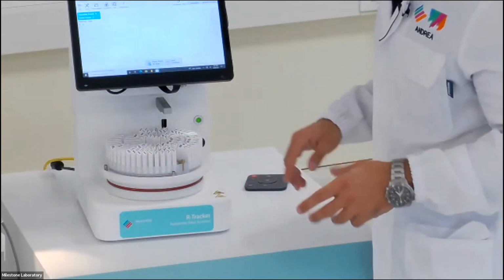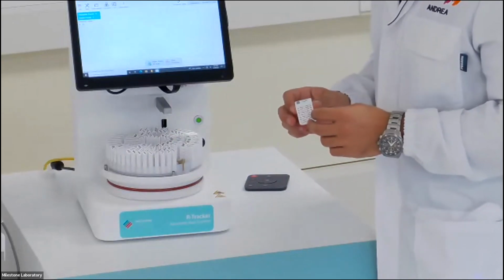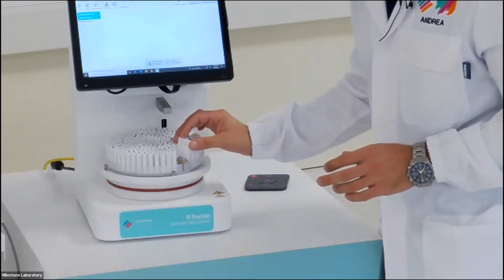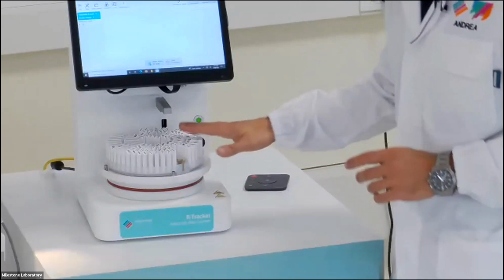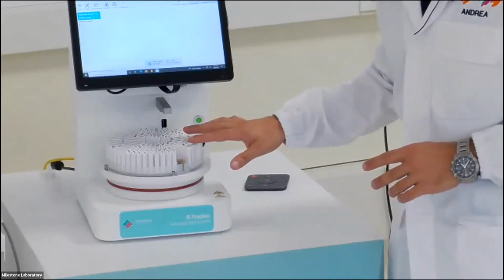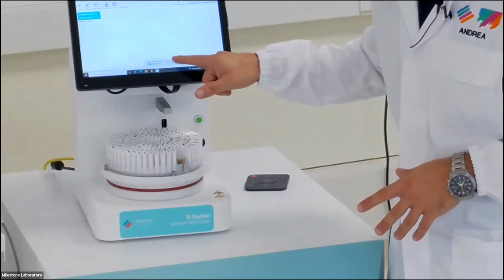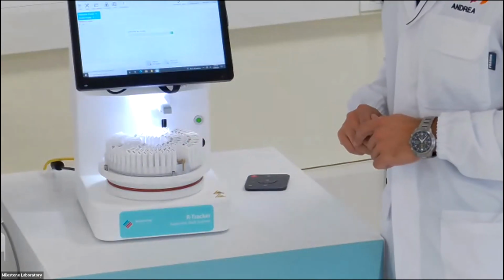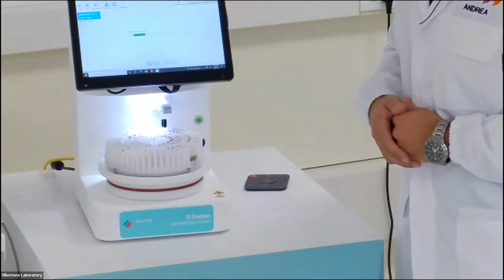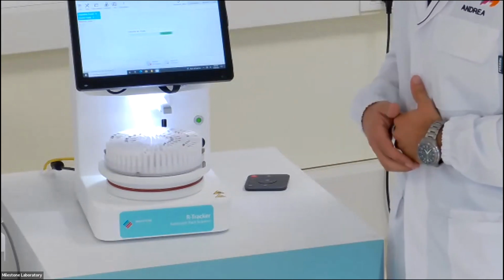By the way, if there is any problem, I'm simulating the problem now. So I'm turning the cassette upside down, so there will be an ID not readable. So I start the run, and in 15 seconds, the R tracker managed to scan and track all the samples.